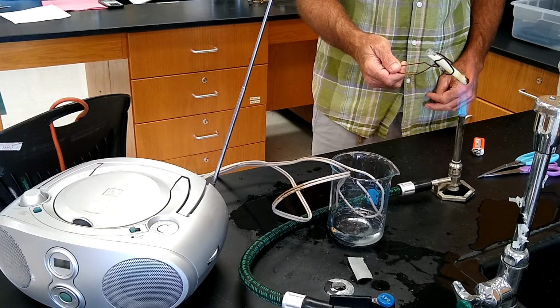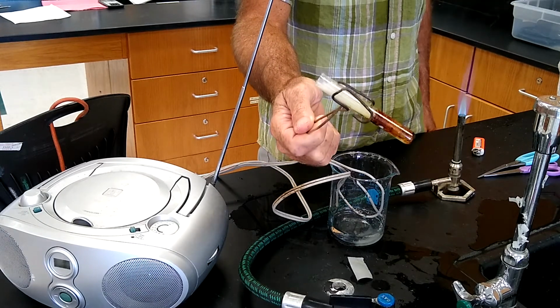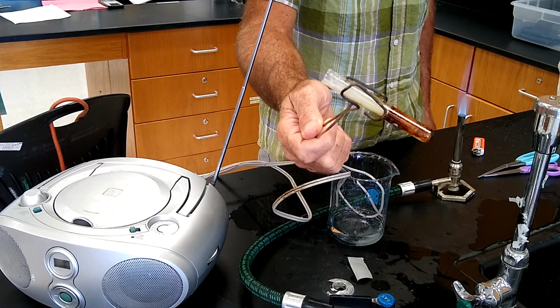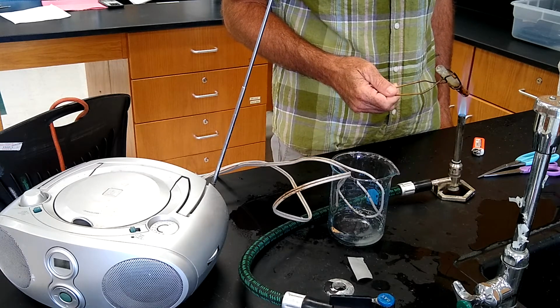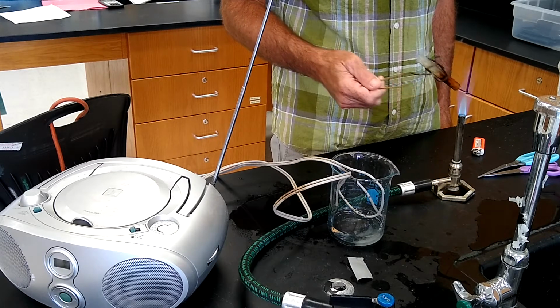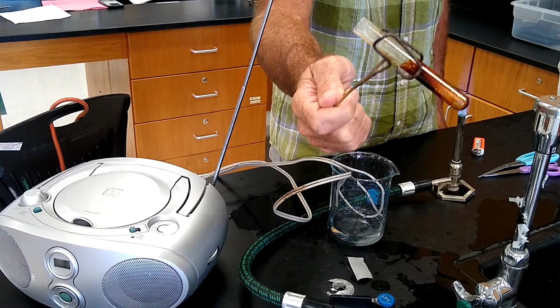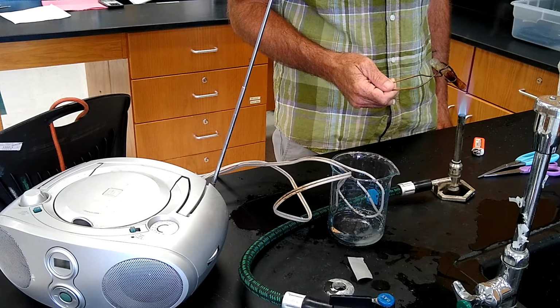Absolutely. Now I'm going to ask you a question. Can you name two signs that a chemical reaction is occurring here? Not just melting. Yes, it did melt, but there's also a chemical reaction. Can you give me two indicators of a chemical reaction? And this smells like marshmallows. It's awesome.